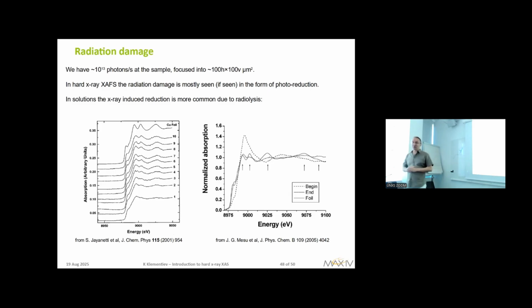So the most obvious is to measure quickly, and that's why we invested a lot of effort to scan quickly. So I showed you example of half a second. We can continuously do 2 Hertz acquisition. So this is in full EXAFS, 2 Hertz in hours.